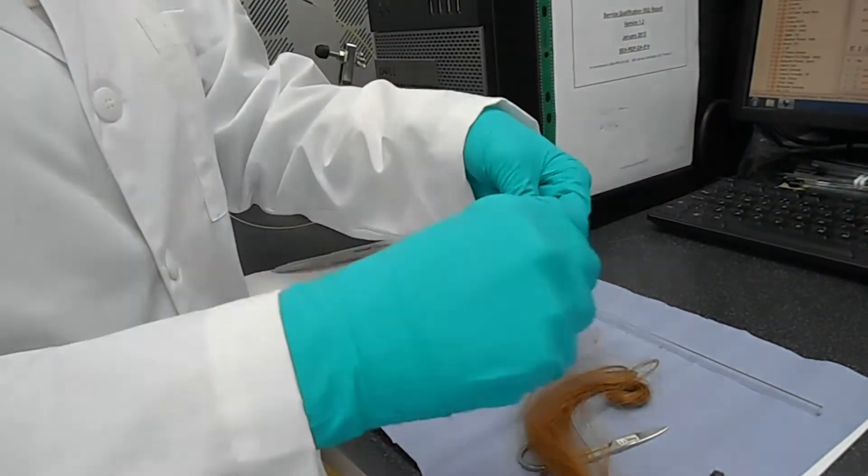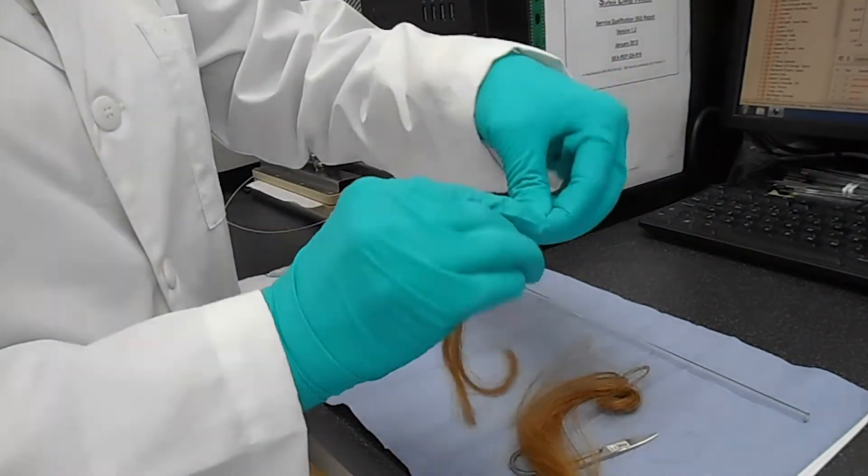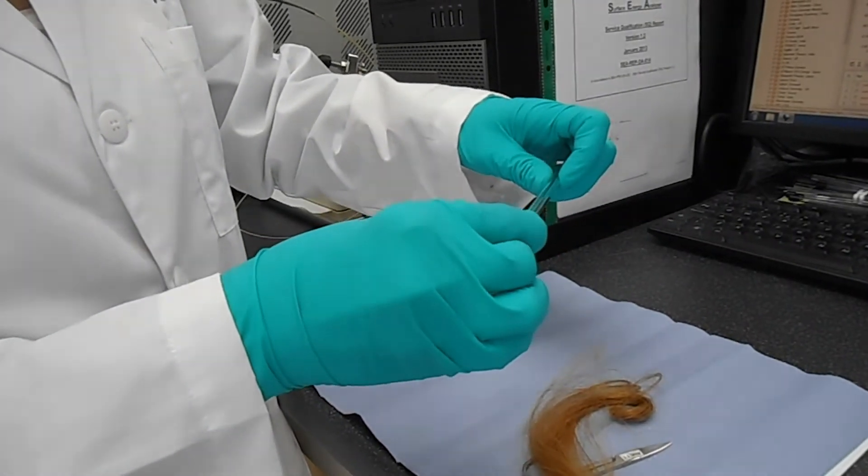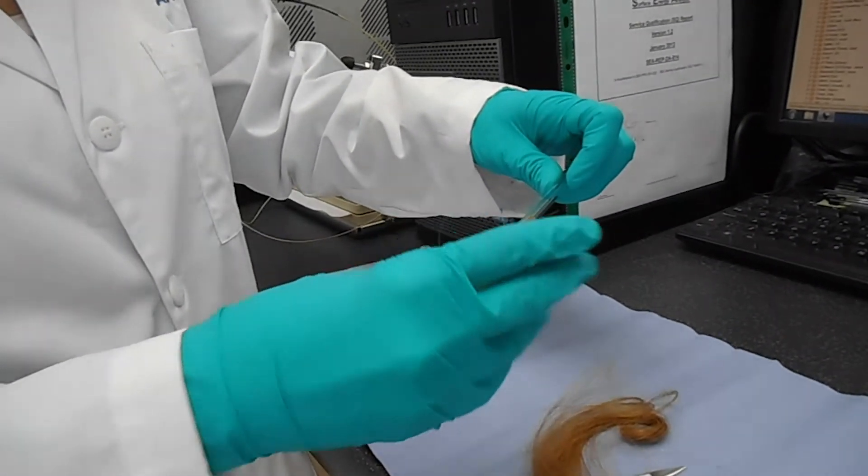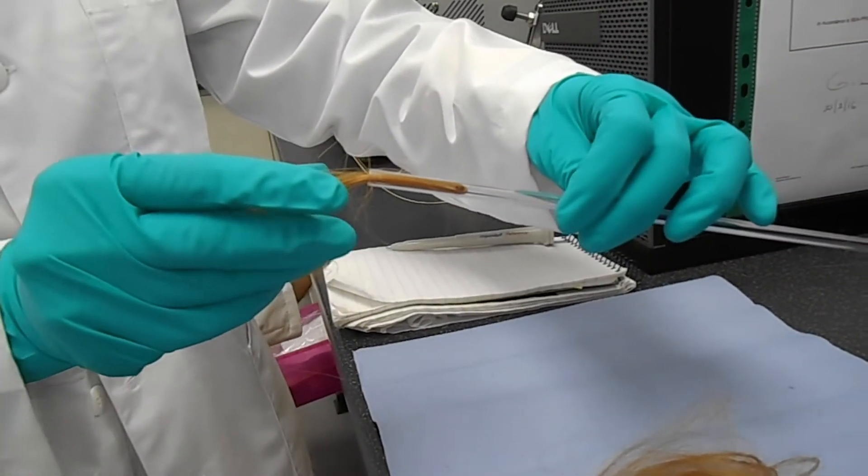After we cut the hair we can actually generate a loop by bending the hair and using this loop we can actually load the sample inside the column and we push it through the column.